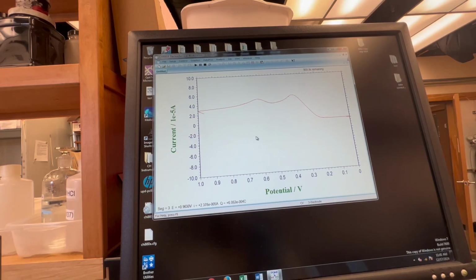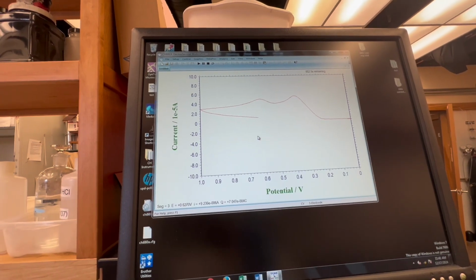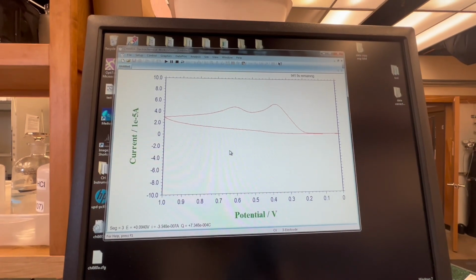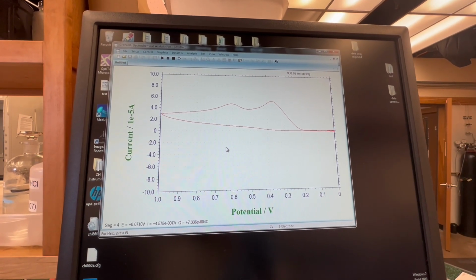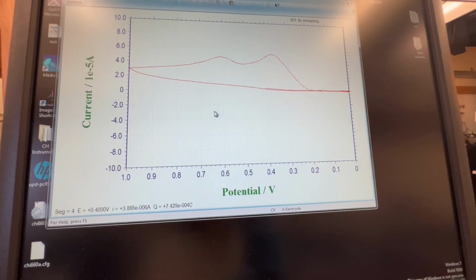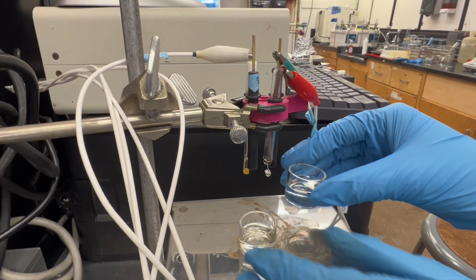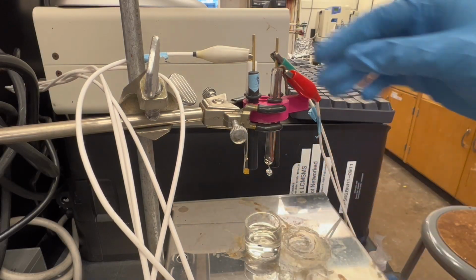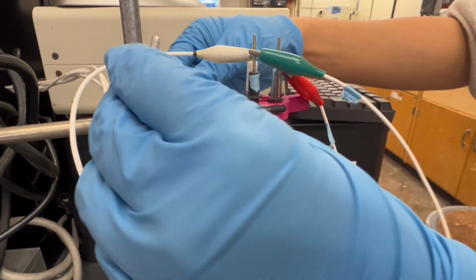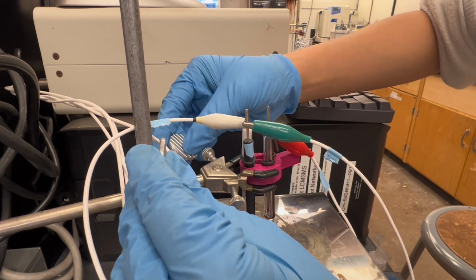This is the electropolymerization graph for the lowest concentration I tried. So maybe it's a little bit flat, but we would always observe two broad peaks. At least it will not only be some sharp peaks. The CV graph kind of reflects that maybe our electropolymerization is good, and then later we'll tell from the signal from DPV.